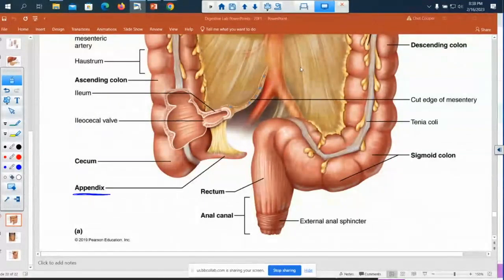do you remember that all parts of the gut have the same layers? They have mucosa, submucosa, muscularis, and serosa. So funny thing, the stomach had 3 layers of muscle, muscularis externa, it had a special oblique layer. The large intestine, its muscle that should go long, the longitudinal fibers, instead of being all the way around and long, they bundle up into little ribbons.